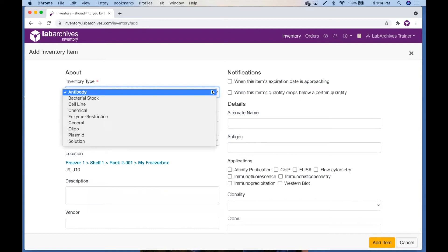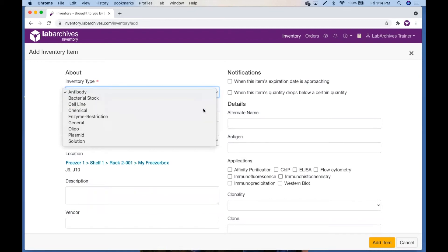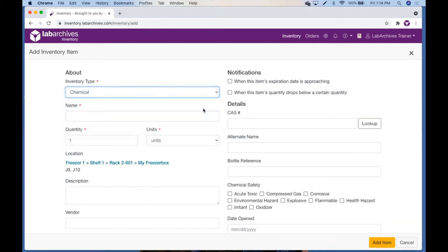With our default chemical inventory type, you can search for a chemical using a CAS number. Input a CAS number in this field and then click Look Up.